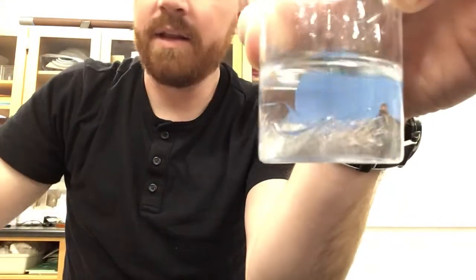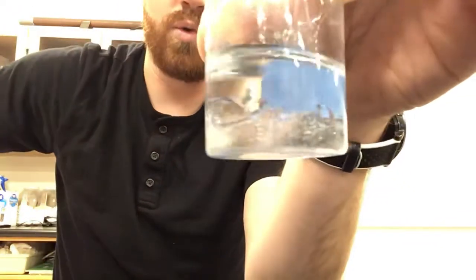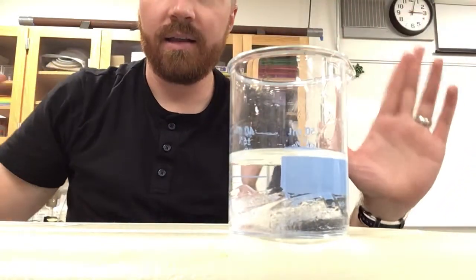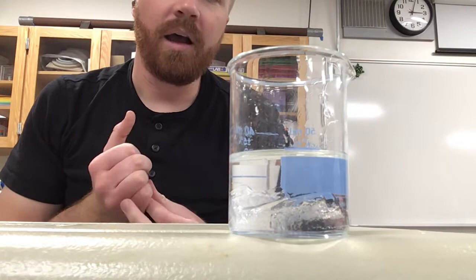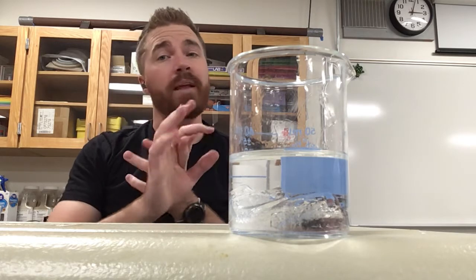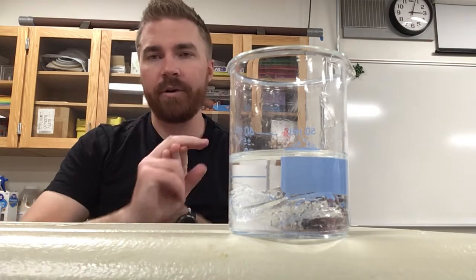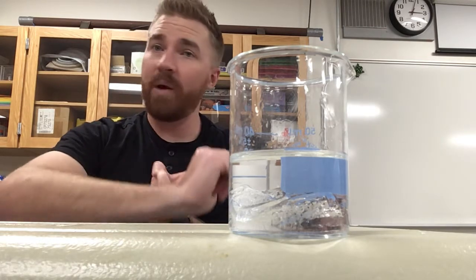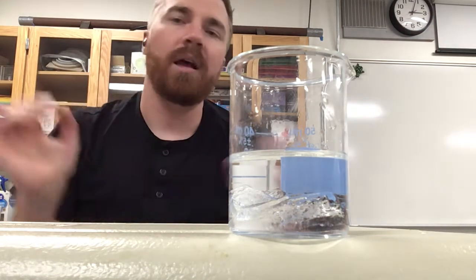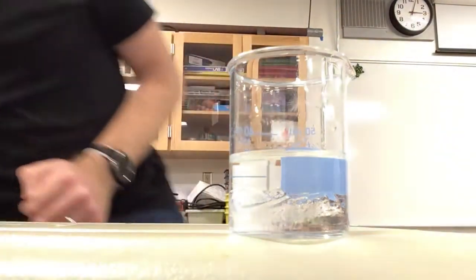Then for the next few minutes, you need to observe what happens to this ice. I'm going to leave it just like that. That'll give me a chance to step away. You're going to make observations, explain why you think those observations are happening, and you're going to ask questions about this phenomenon that's going on right now. So give it a few minutes to observe the ice in the solution that's not water.